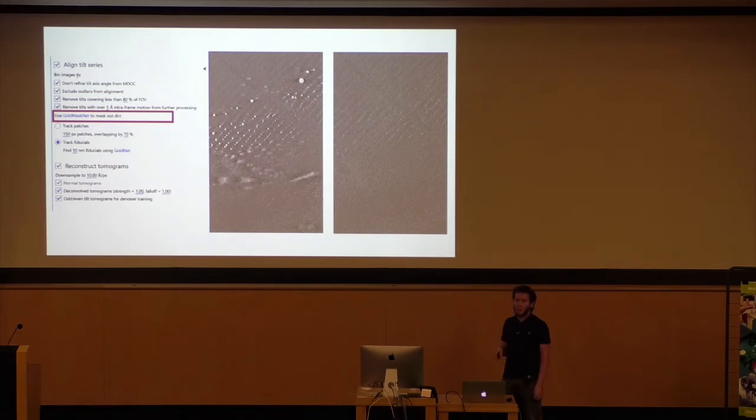For example, template matching goes crazy when there are such high contrast objects. Now, it didn't catch all of those tiny blobs, basically because I was just too lazy to create training data that included all those tiny blobs, because you have to click a lot. But if you took the time, you could also get rid of the smaller things.